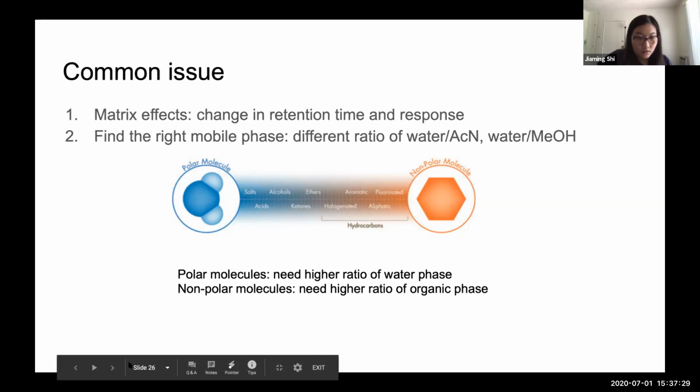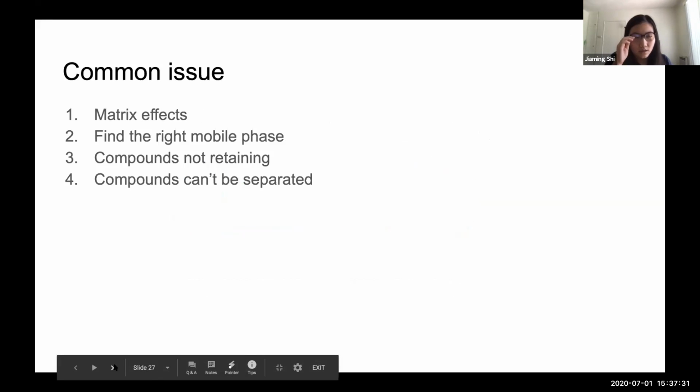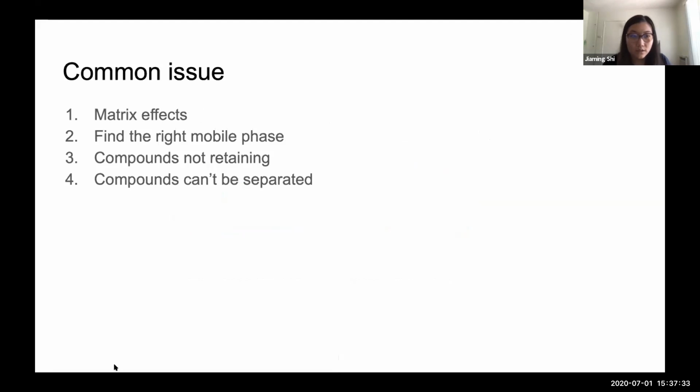And then the next common issue is just the compound is too polar, because we use reverse phase HPLC. That means the compound is not going to retain at all. It will just be too well dissolved in water and will just shoot right out of the column.